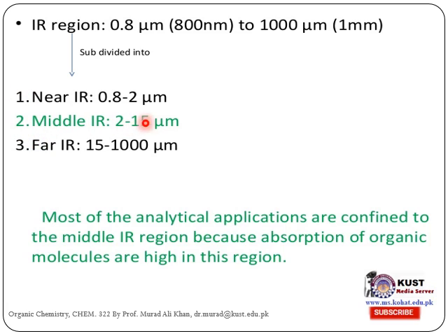The middle IR is the region of interest of the chemist because nearly all compounds give spectrum in this region. Most of the analytical applications are confined to the middle IR region because absorptions of organic molecules are high in this region.